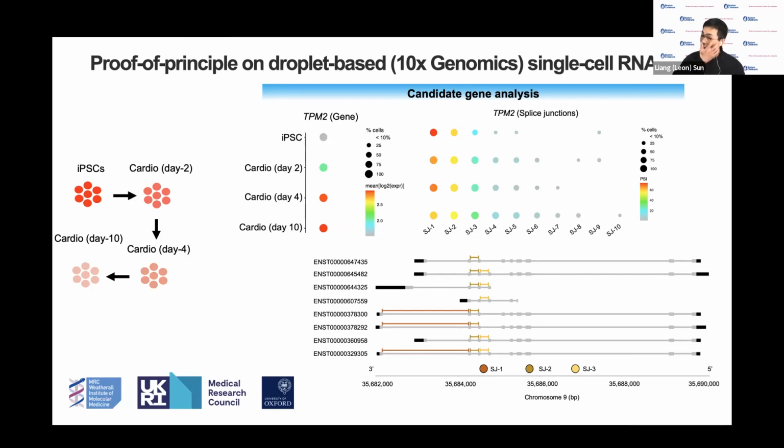Yeah, so most of the time, in my experience, we do the bulk RNA-seq or single cell RNA-seq until we cannot find any differentially expressed genes, or any interesting differentially expressed genes. Then we switch to the RNA splicing analysis, to see whether we can find any differentially spliced transcripts. So that's most of the cases. I was also curious in what kind of case we try to do single cell splicing analysis, but I think your explanation sounds reasonable.